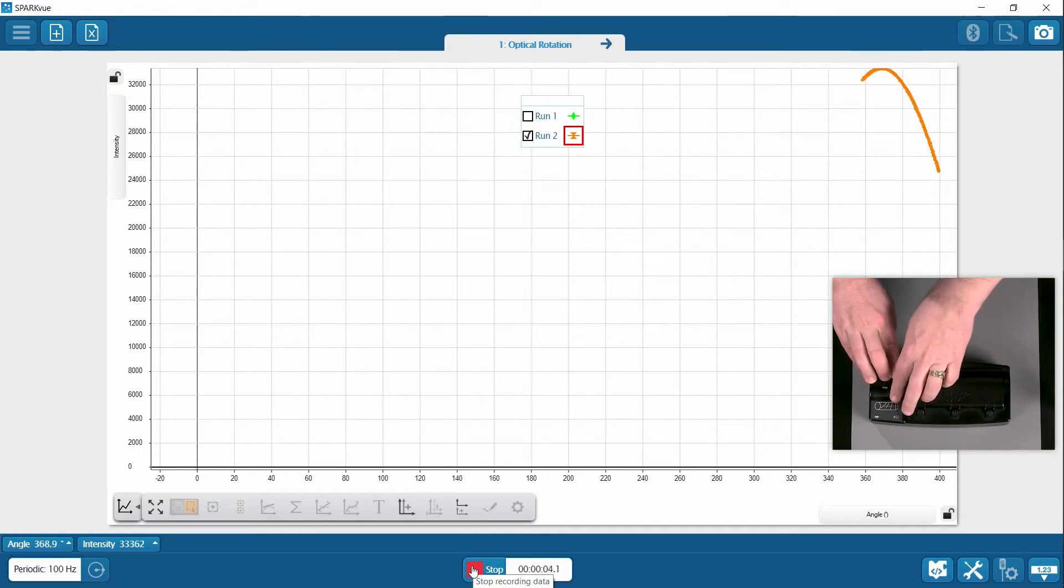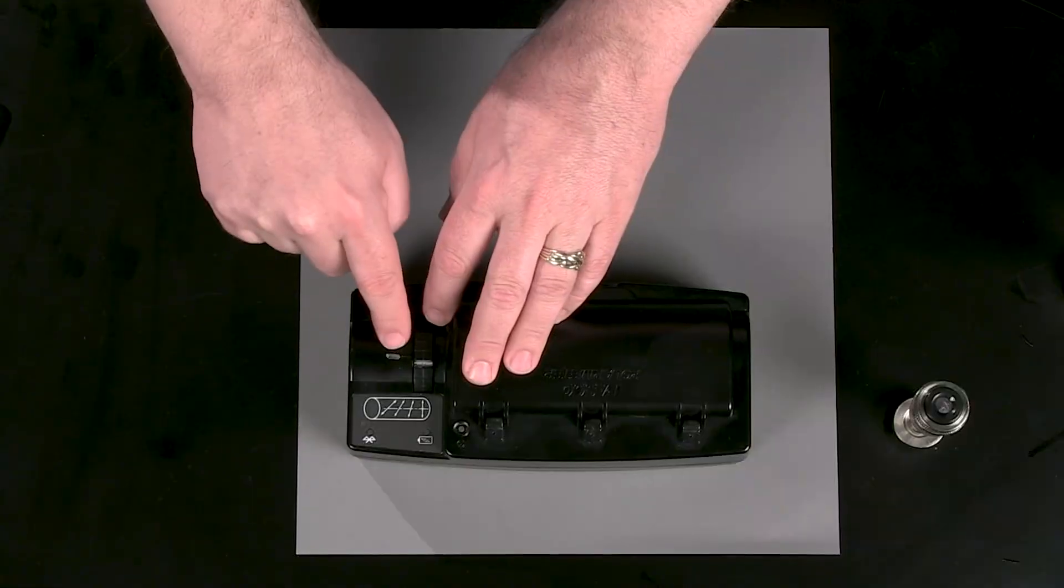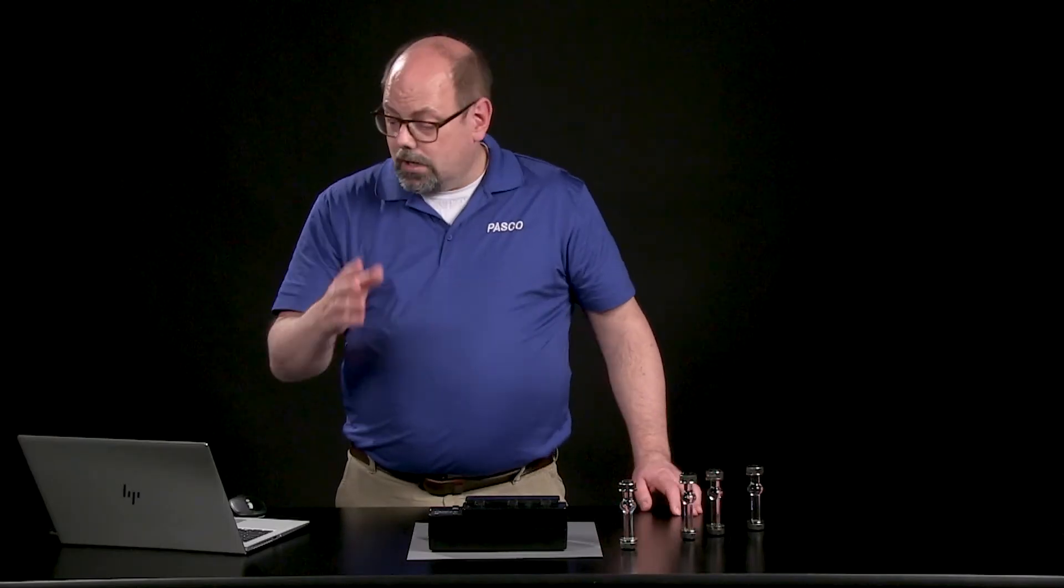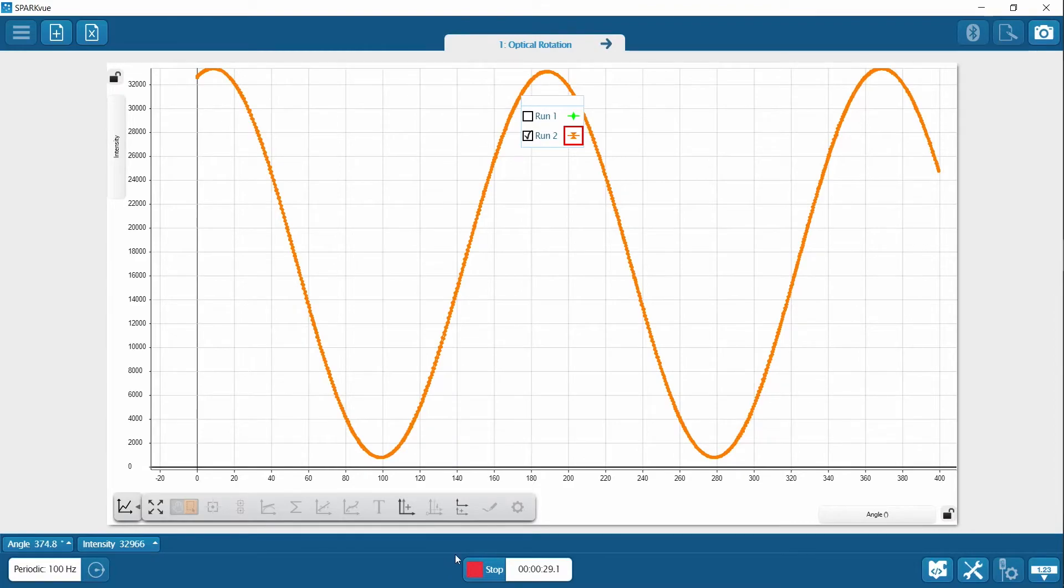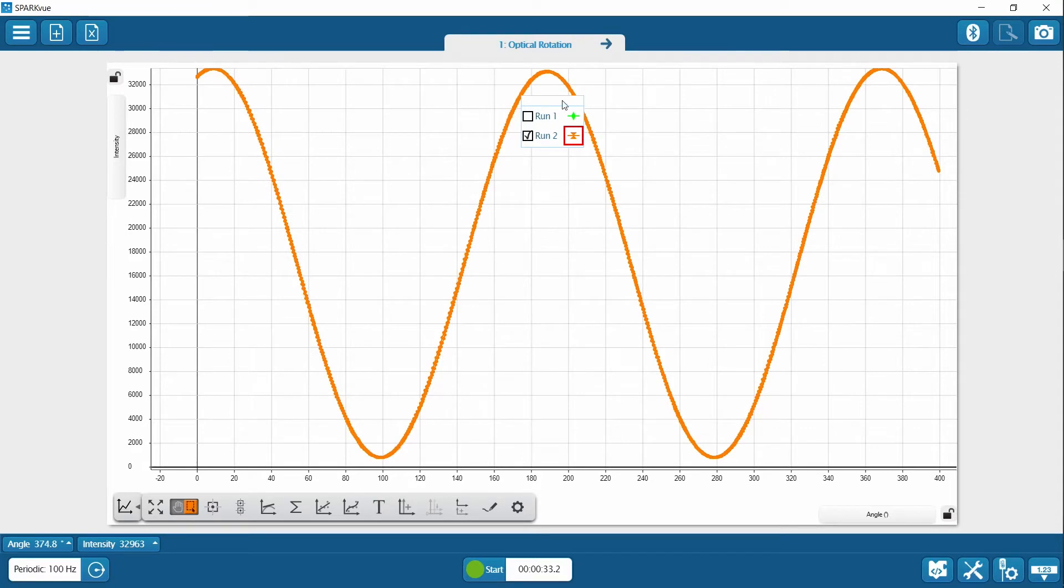Notice I must have moved the wheel a little bit. Don't get worried about that because you'll see I'm just going to rotate it back. Even if I had started here, which is a little bit further ahead than the mark, if I rotate it the other way, you're going to notice, as long as I do it evenly and not too fast, that you're going to get the same set of data. So don't worry if you start closer to 360 than you do at zero degrees, but that way you'll get a nice collection of a full circle of that wheel.